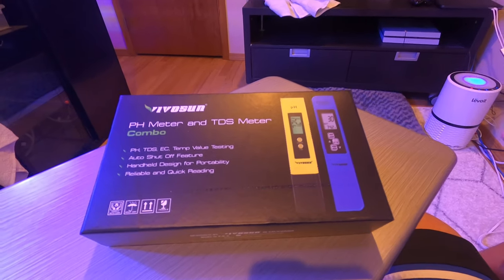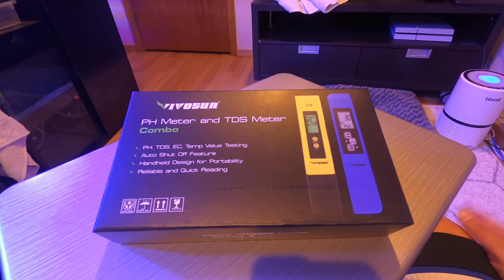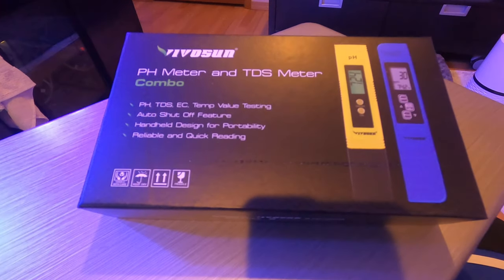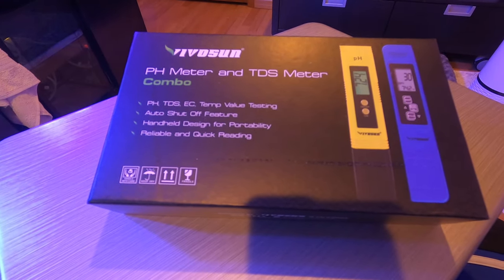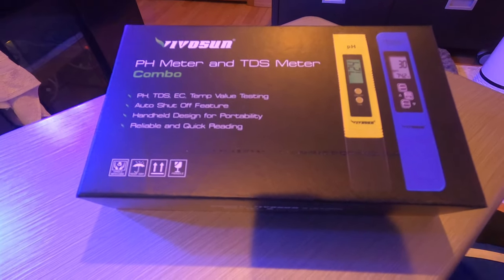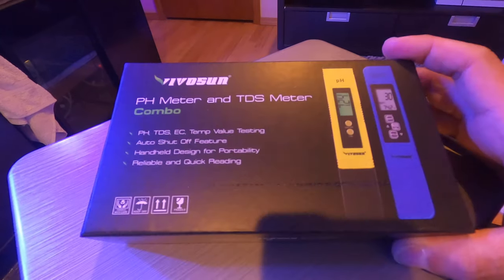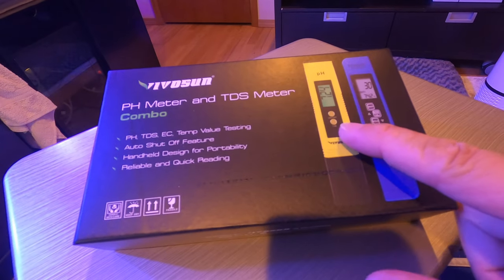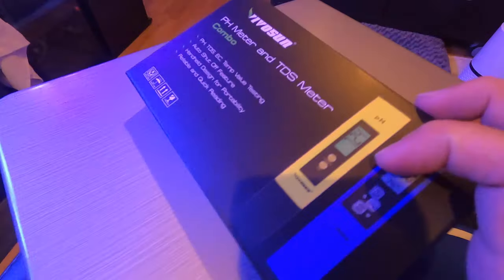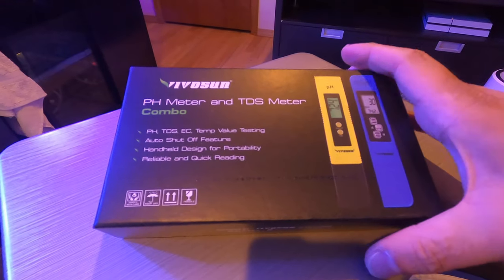Originally I was going to go for the HANA test kit, but as good as the brand is, I feel it's a little overpriced. The same HANA kit that includes pH and temperature ranges from $40 to $60. This kit comes with two monitors — one for pH and one for TDS — and goes down to two decimal places, for $20 from Amazon.